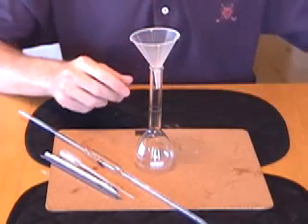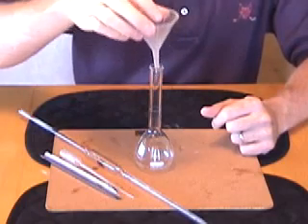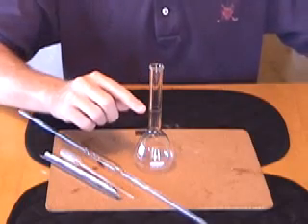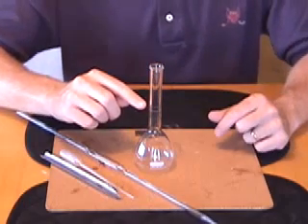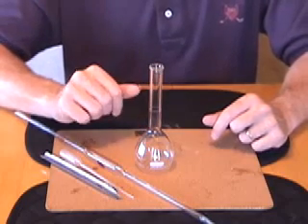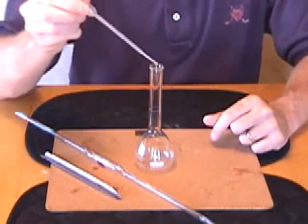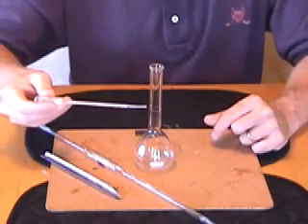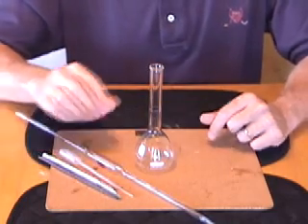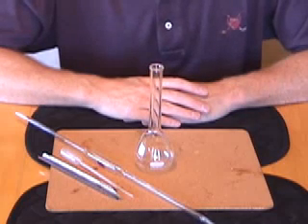That's my rule. Then you're going to take a little wash bottle to rinse out that funnel, and every time you rinse there, make sure you did not pass that meniscus line, because if you did, you've got more than 100 milliliter solution. So maybe the water level is up to here. What you want to do then is bring it up to just below the line, and then get some water in an eyedropper, plink, plink, plink, to finish the job. When the bottom of the meniscus of the solution touches that line, you've got yourself 100 milliliters, as precisely as you can determine it in a lab.